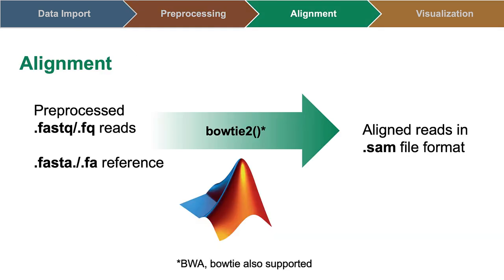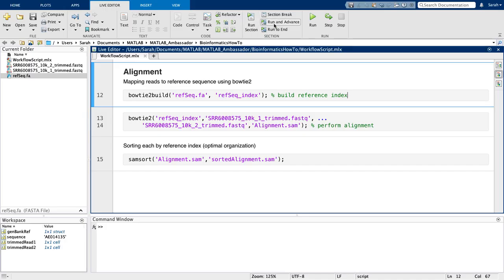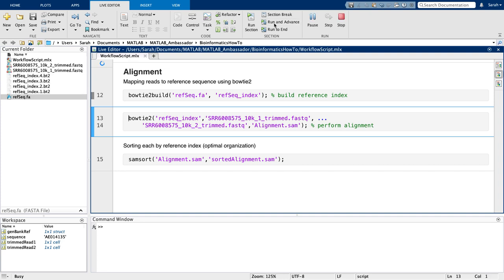Next step is the read alignment, where I will finally align FASTQ reads to the FASTA reference file, resulting in a SAM alignment. Here I am using Bowtie2, however, the common alignment algorithms BWA and Bowtie are also available in the Bioinformatics Toolbox.